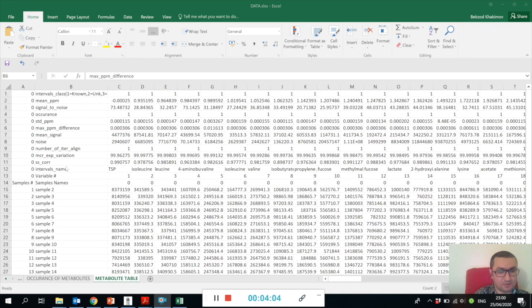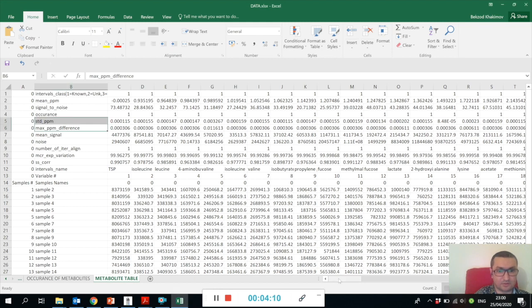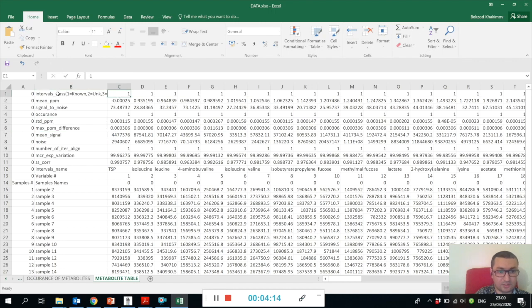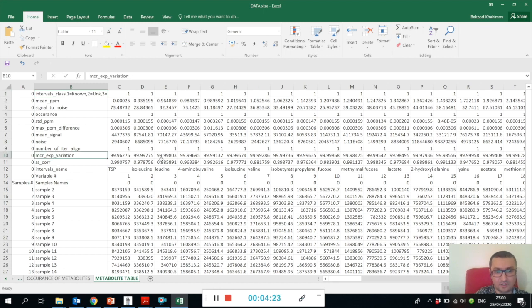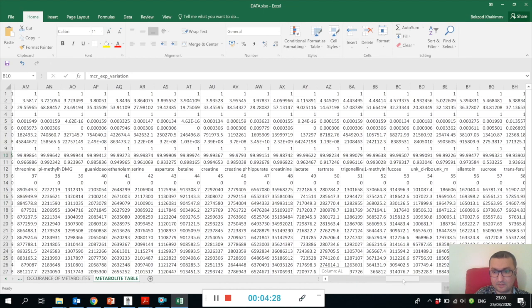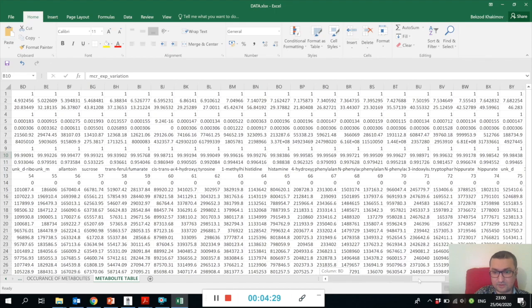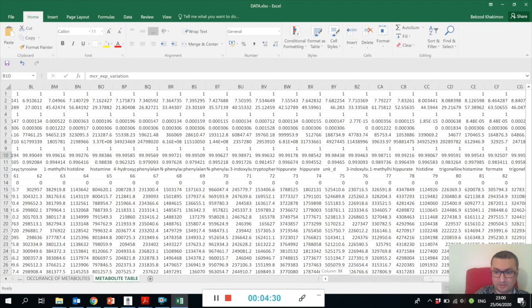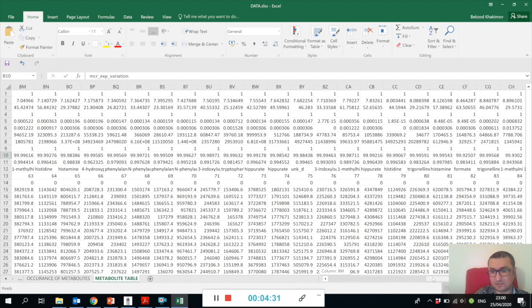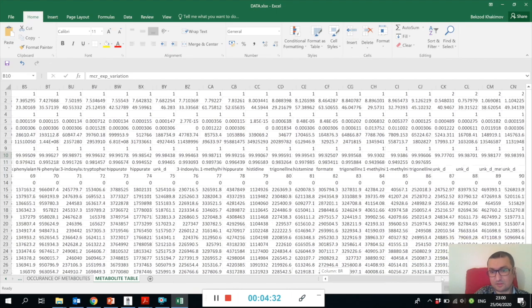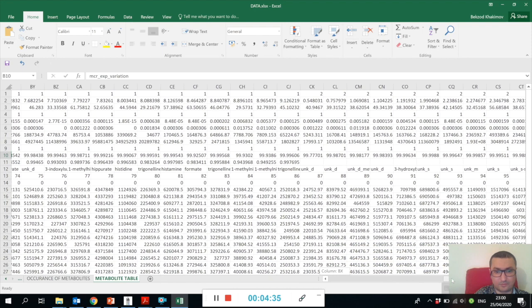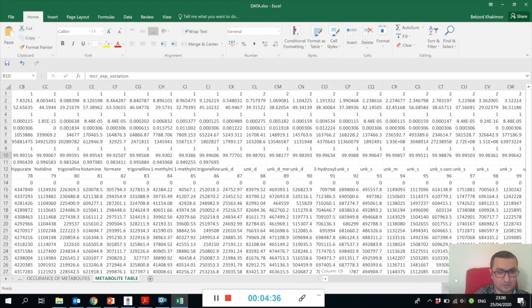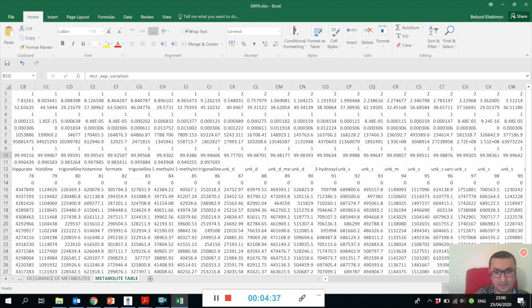The most important thing is that you should pay attention to the three kinds of variables. The first class belongs to the knowns, which means they are all quantified using MCR. You can pay attention to the explained variation of MCR - they're all very high because this is simple data which is just pooled human urine spectra.